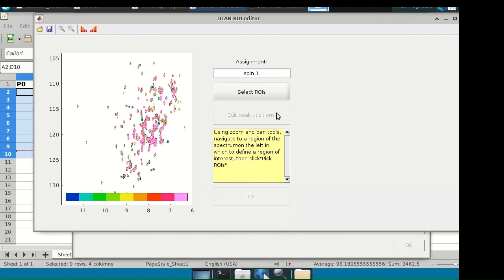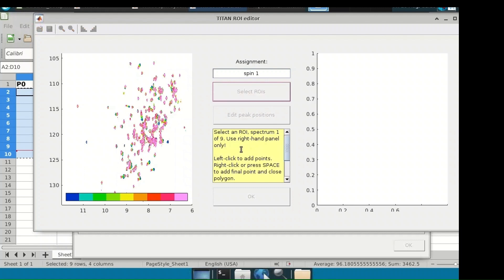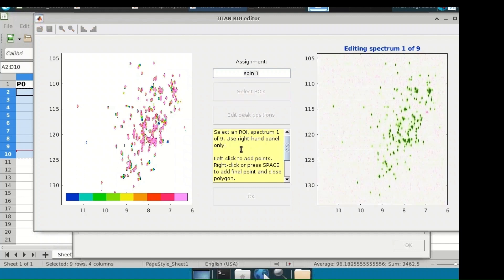When the spin system editor is opened, a new spin will be created automatically and the ROI editor launched. The left-hand panel displays an overlay of all the experiments in the titration series, and density plots of each spectrum are displayed on the right-hand panel, which can be used to mark out the ROI. For every spin system and spectrum, a region of interest from the experimental data must be defined to select the data points to be used for fitting. Each spin system is a single residue represented in Titan by sets of direct and indirect spin chemical shifts and line widths. Prior to fitting, initial estimates need to be given for each state specified by the binding model, which must have chemical shifts and line widths associated with it.